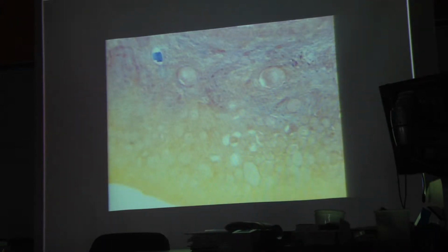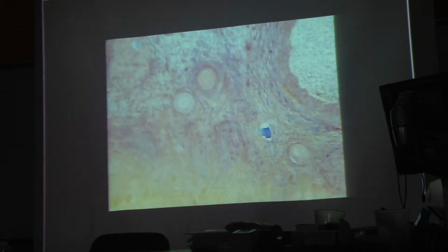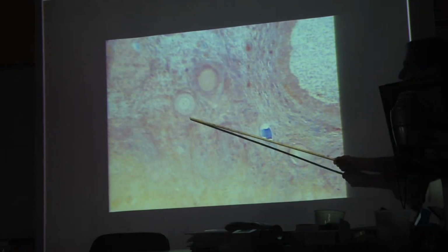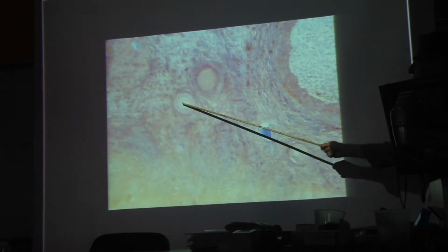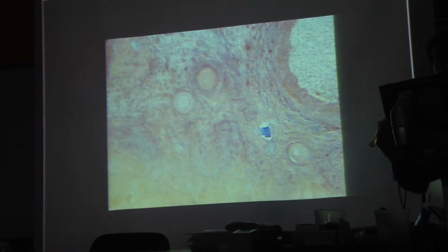But once she goes through puberty and her menstrual cycle begins, then every month, in human females roughly, as you know, these follicles begin to develop. And they grow into a larger multicellular structure, which is called a primary follicle. You see one right here. What appears to be the nucleus of a cell and cytoplasm is actually the developing egg cell, the oocyte.